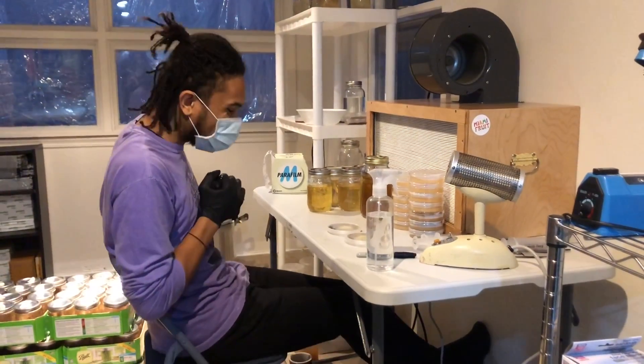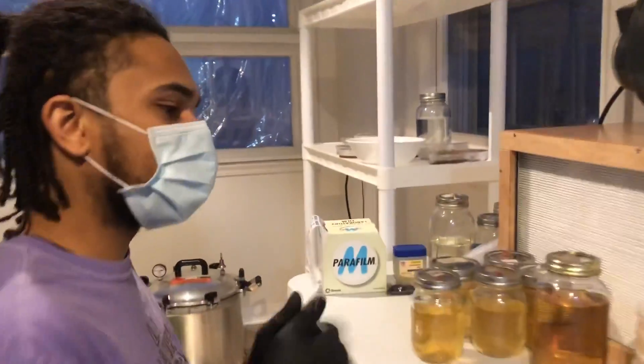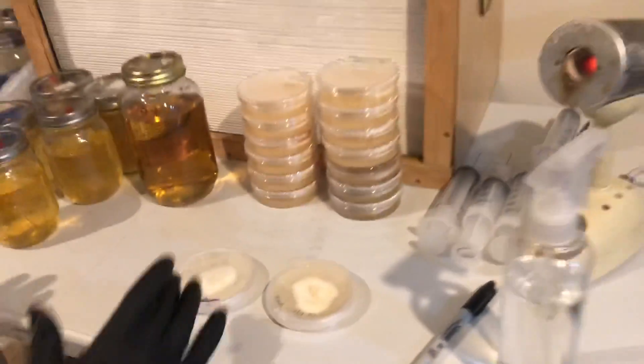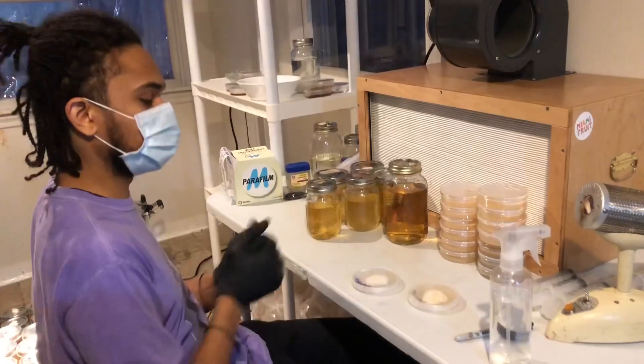Hey everybody, William B. Brown coming back at you. Now we have our liquid cultures that have cooled down and I have poured the agar into the plates. What we're going to go ahead and do is transfer some of these new cordyceps cultures into the liquid culture and then also onto another plate.